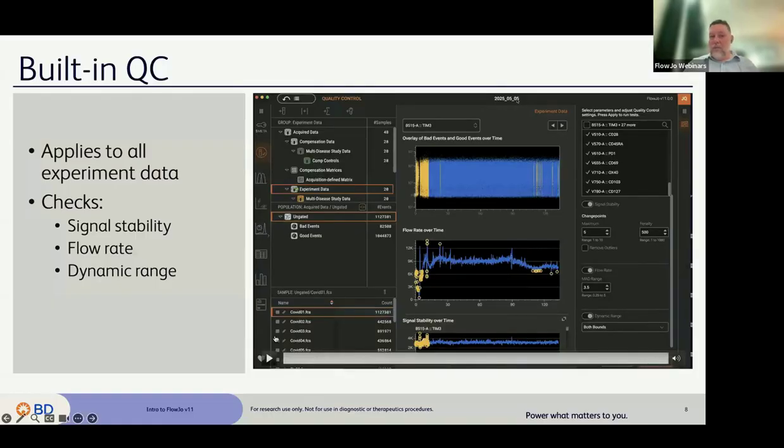You can scroll through them or change by selecting what sample you are focused on here in the samples pane, or use the arrows. You can change which signal you're actually focusing on at the top by selecting it here. And of course, you can rerun it with different tunables if you would like to replace the results of these data. But it is much faster than the R-based plugin algorithms that we are currently employing in FlowJo v10 for quality control.